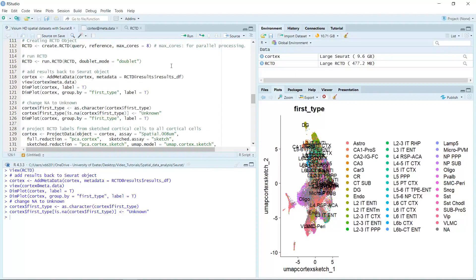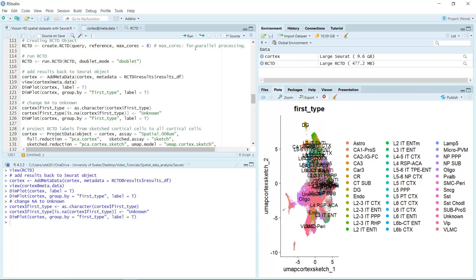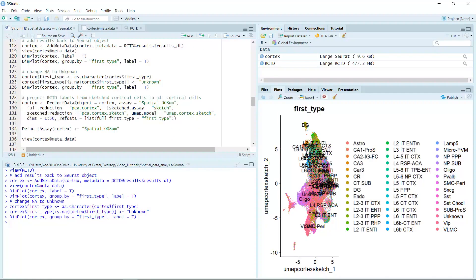We can use the dimplot function again to check. You can see we changed the NA label to unknown cell type. Now we can project the sketched dataset to the full dataset. The full C will be spatial .008 micrometers. We use the full reduction as PCA cortex, the sketched C reduction as PCA cortex sketch, and the UMAP model as UMAP cortex sketched. After naming all the cell types, we will get a column named full first type. Now we can run the project_data function to project the cell types from the sketched data to the full dataset.